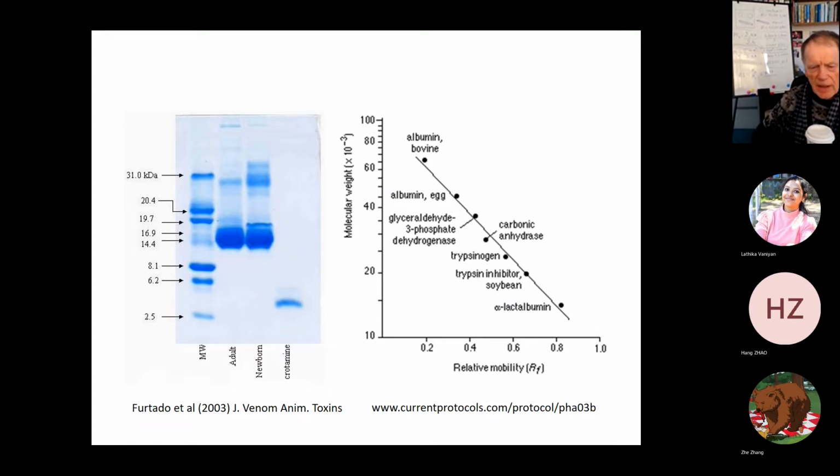With DNA, you use a different type of gel, a more porous gel, because DNA molecules are larger. So we use agarose rather than polyacrylamide, and also because DNA molecules already have a regular charge because of the phosphate residues on the sugar phosphate backbone.